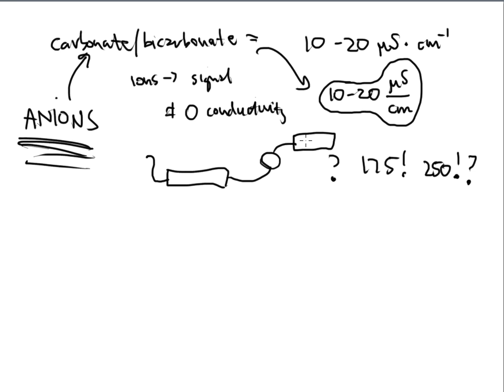Very often, what that requires is for you to get rid of the mobile phase that was made, and you need to remake the mobile phase and then place it back into the instrument, give it another flush for 30 minutes, and hopefully that begins to go down. Another reason that your conductivity might go up is due to suppressor problems.